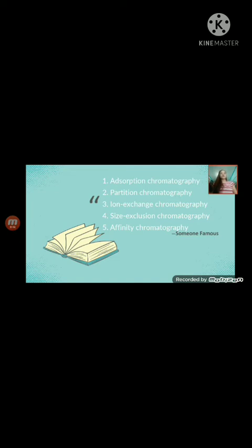Then the third one is ion exchange chromatography, and then size exclusion chromatography. Size exclusion is focused on the size. Then lastly is affinity chromatography.